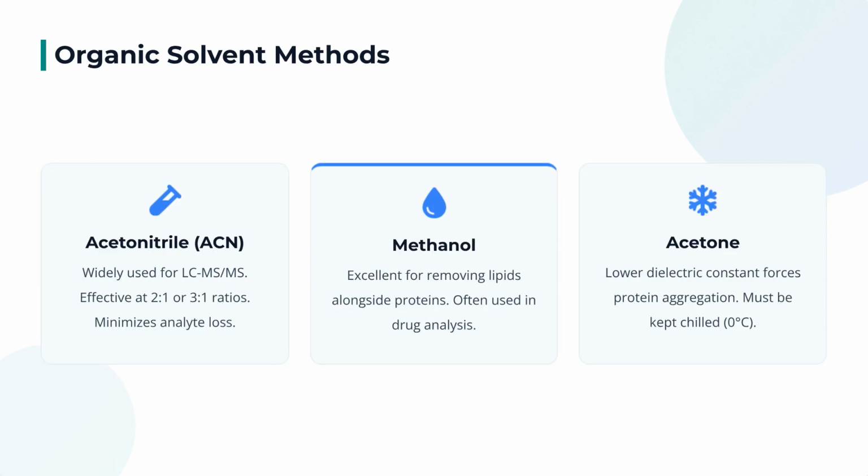Organic solvents are also effective. Acetonitrile is widely used for LC-MS. Methanol is excellent for removing lipids, and acetone forces protein aggregation but requires chilling.